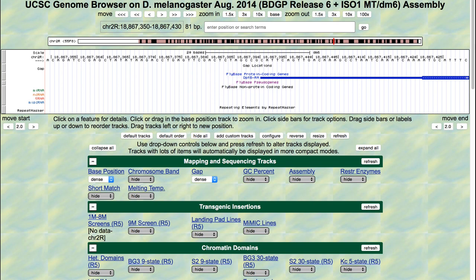Short Match can be used to search for short sequences between 2 and 30 bases long. For this example, we will use Short Match to search for the initiator motif, or INR. The INR is a motif associated with the RNA polymerase II core promoter, and previous studies suggest that transcription factor II-D, or TFII-D, binds specifically to this motif.